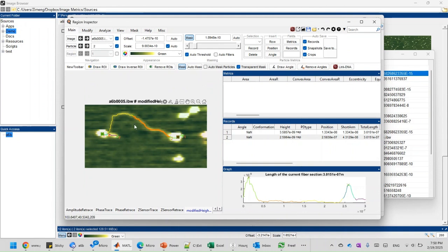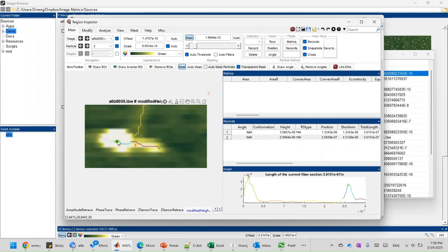so 1 to 2 to 3. So this point should be the entry point, should be 4, right? So it'd be like this. Start from here, and then it goes to 5, which is the peak point, and 6 is the exit point. So 4 and 6 essentially overlap. Okay, so that's really good. That's exactly what we want.